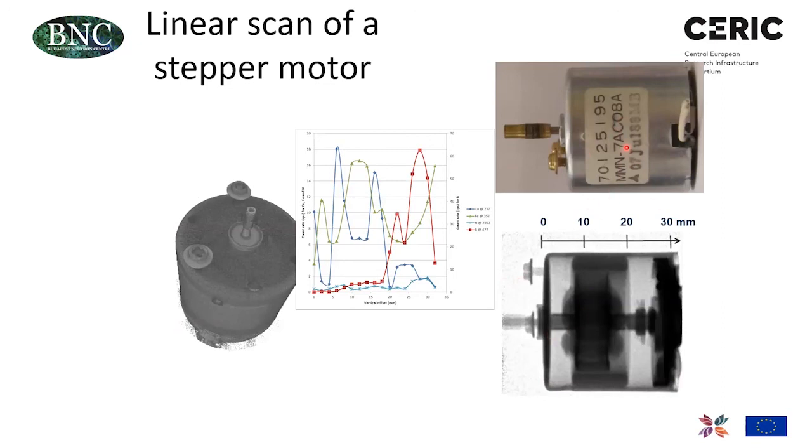This is a very old one. Here you see the radiogram, and we measured gamma spectra along its long axis, slice by slice, and then you get such peak patterns. This greenish one is the iron, then the dark blue is copper, and here you have hydrogen, no, boron and hydrogen. Without knowing the internal layout of the object, it's very hard to explain.